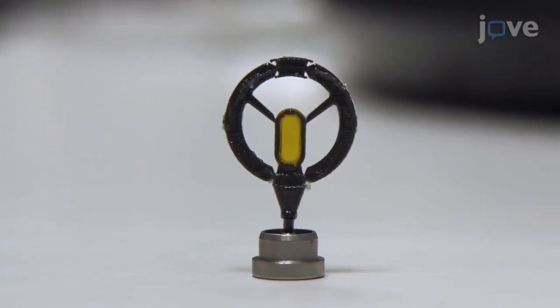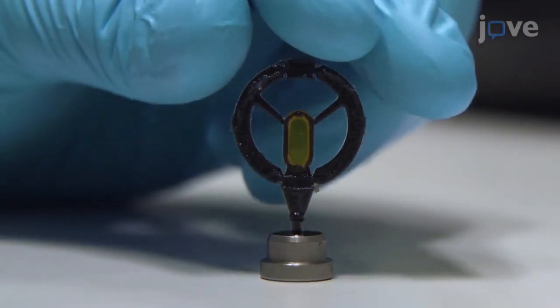The very important aspect is that there is no manipulation needed. A sample holder featuring these aspects did not exist before.